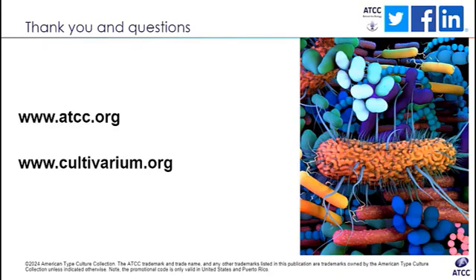Sounds very valuable. How about this? What are the biggest challenges you face? What are some capabilities that you are thinking about developing to help you accomplish this awesome vision of making more microbes editable? We are aware that each organism is unique, and we always try to adjust our toolkits to these unique organisms.